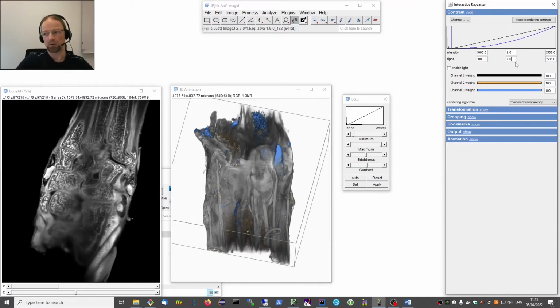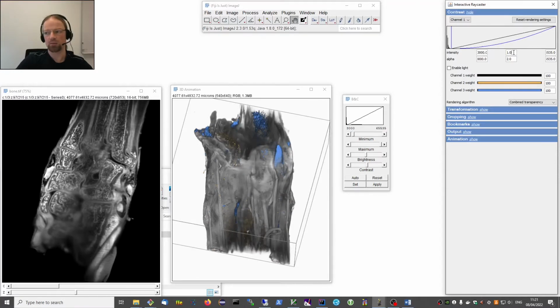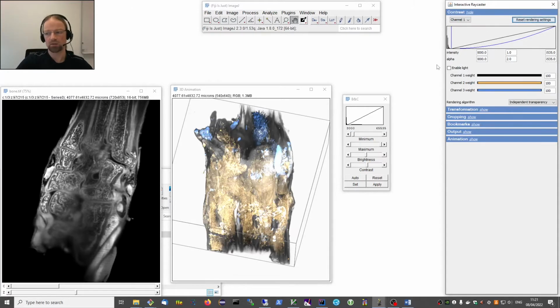And so my recommended way to go about this is that you, as I told you, initially adjust the brightness and contrast, and then once you've opened up 3Dscript, it's probably not necessary anymore to touch the minima and maxima, but just get a quick adjustment by changing the gamma values. Now these values are here per channel, so we can go to another channel and do individual settings for the second channel and for the third channel, of course. And in case you got lost, as I mentioned, there's this reset button so that you can start over again.